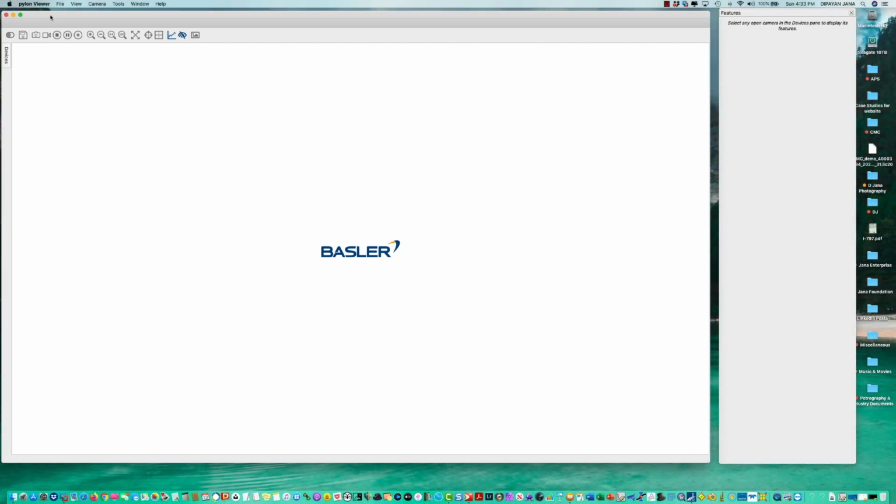So once you open the Pylon Viewer, you go to the device, it shows you all the USB cameras, or if you have any camera which is connected by Ethernet. Basler also has Ethernet port cameras used for industrial applications, but for most of the concrete petrography work we use the USB 3 camera because of high frame rate and high speed.